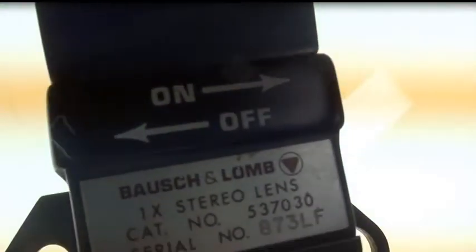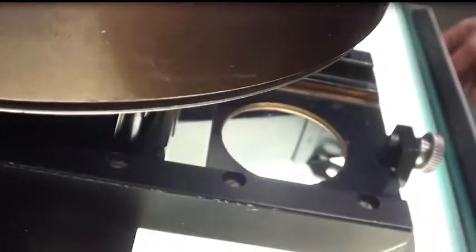So you can see it lights up great. You can actually dim the light or make it brighter depending on what you'd like.